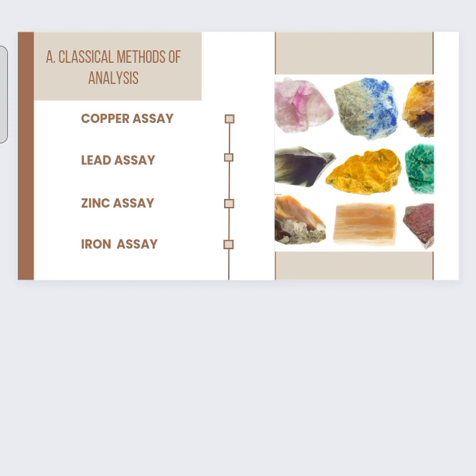So first, we tackle classical methods of analysis. Under this, we have copper assay, lead assay, zinc assay, and iron assay.